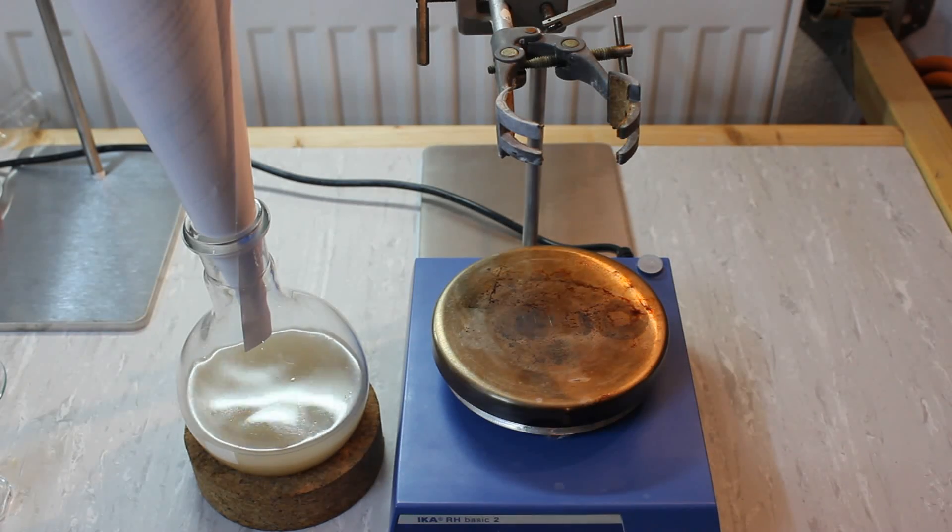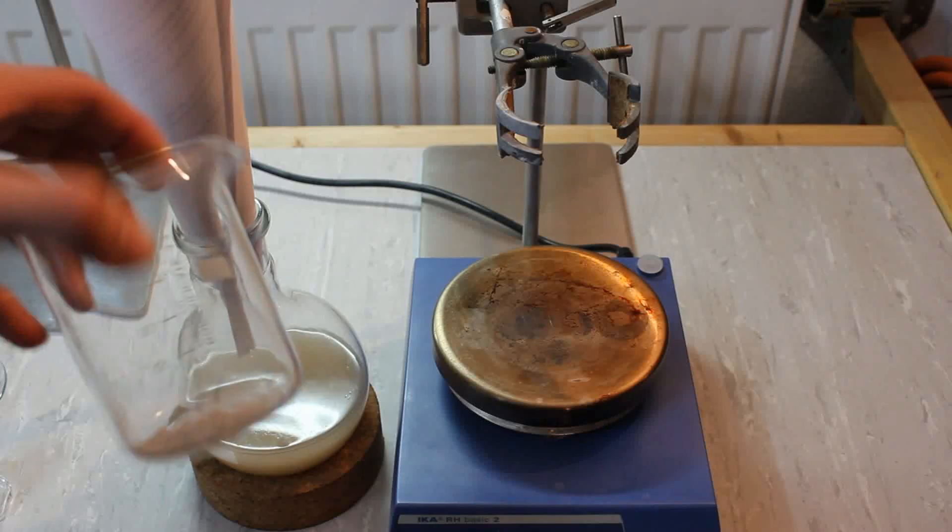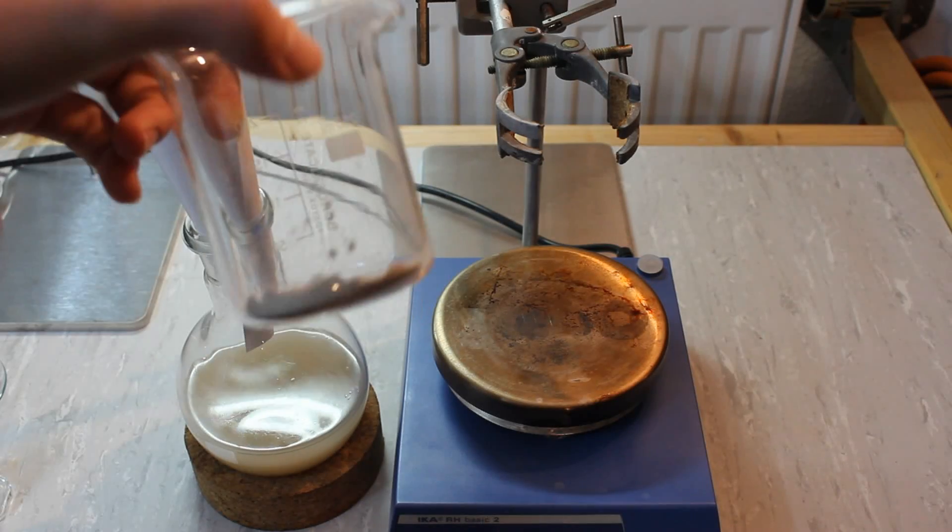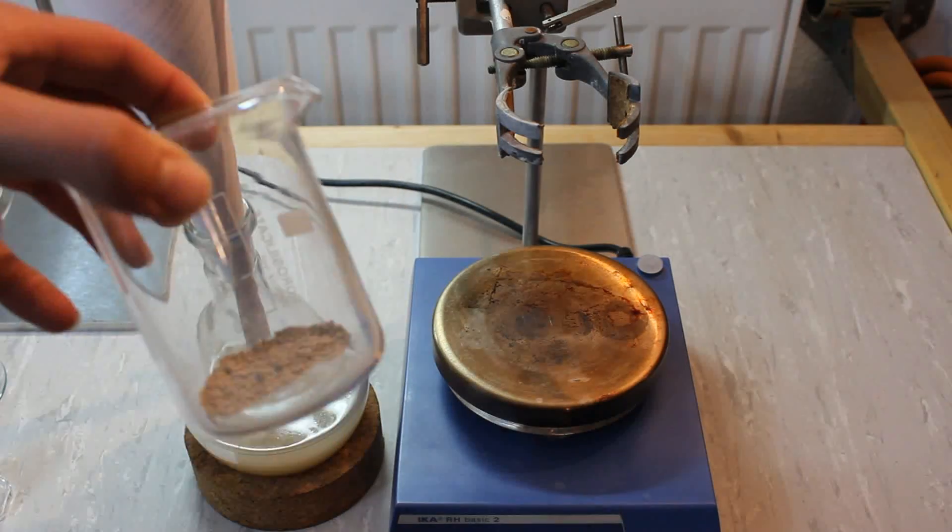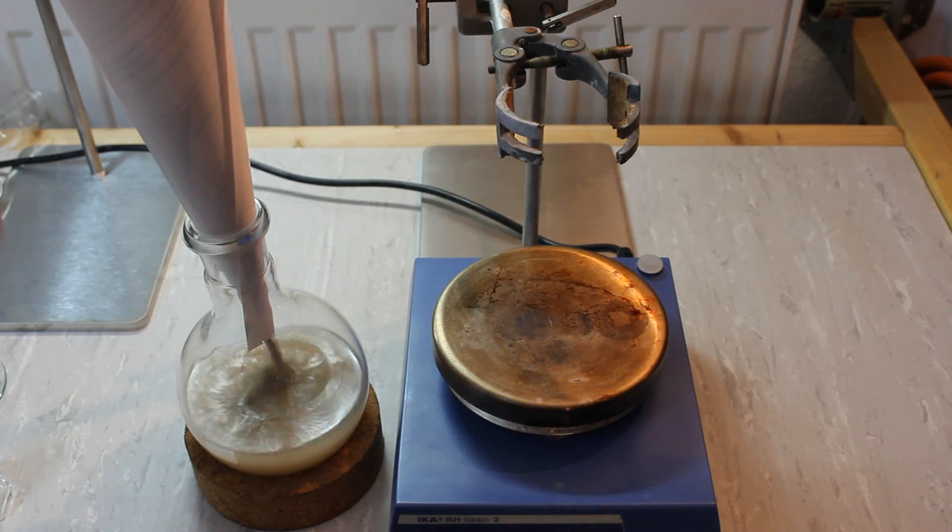Next we distill our acetone over some fresh calcium sulfate. The procedure calls for adding another 10 grams per liter of calcium sulfate. So since we have 250 milliliters of acetone, I weighed out another 2.5 grams of anhydrous calcium sulfate and I'm going to add it to our acetone right now.